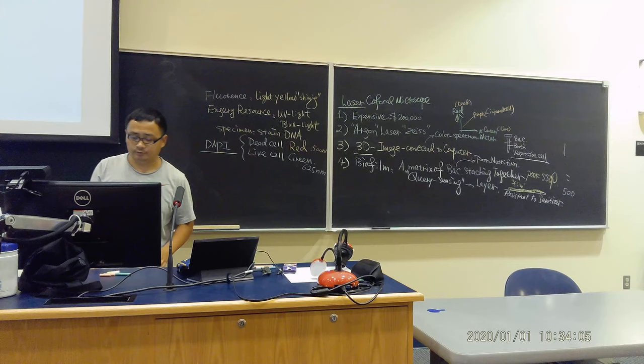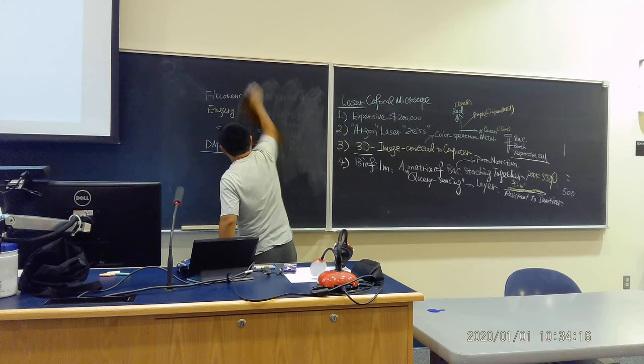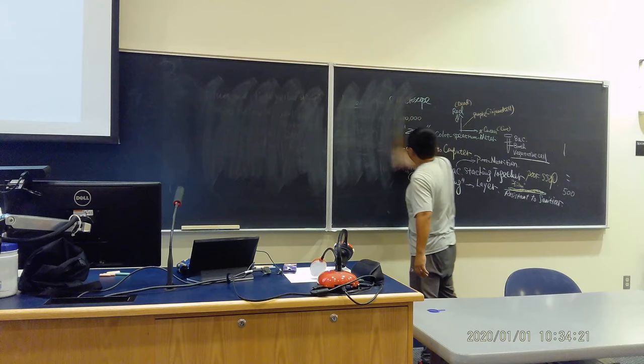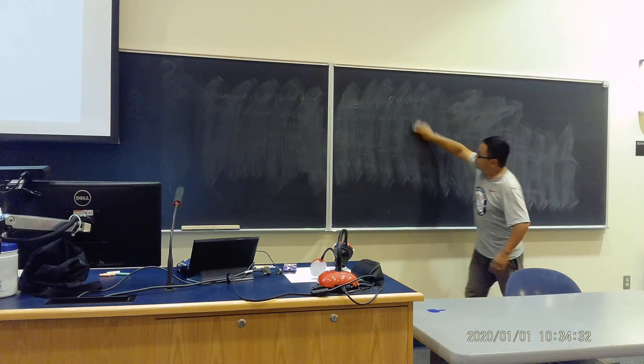Okay, when we talk about this, we will talk about the smear preparation, and we will introduce you in detail to all the staining technology. Some of them we will do in the lab, some of them we will not. These slides I will go over real quick because we're going to practice in the lab, and some of you already did. This is called smear preparation. How you make a smear before you use a microscope.